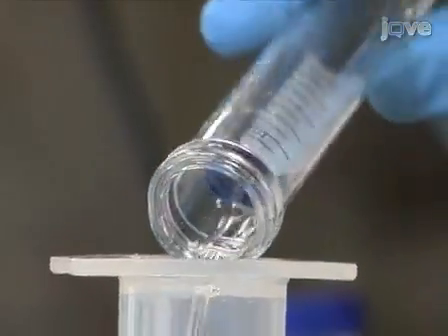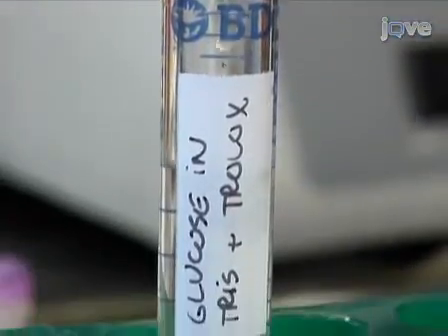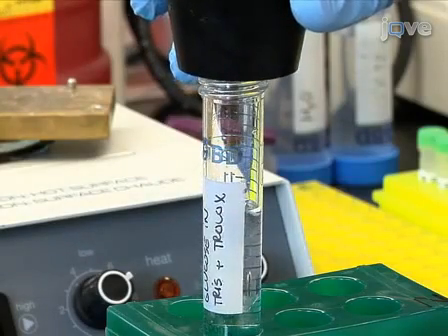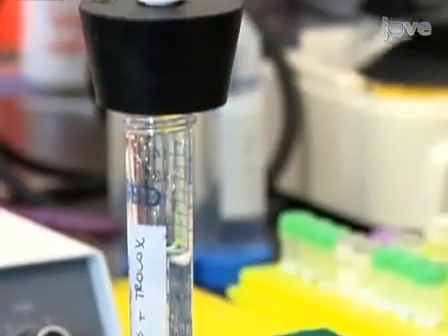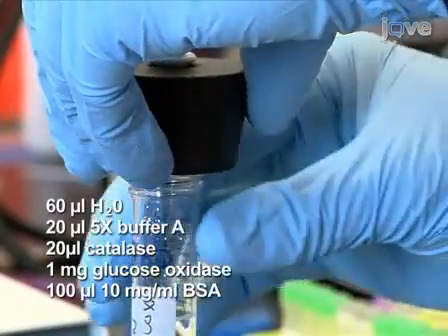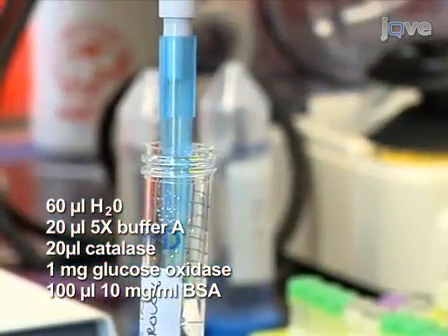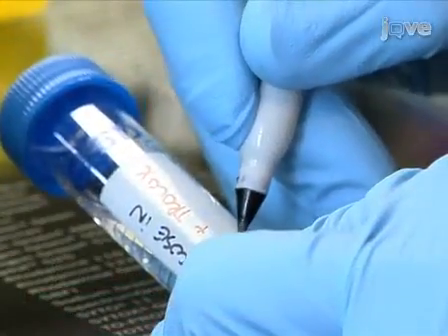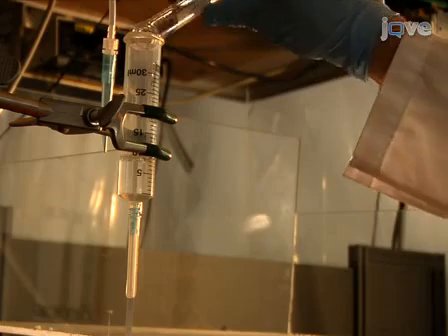Filter the solution and leave it degassing in a vacuum for 10 minutes. Gently mix the Trolox solution with the Gloxy enzymatic solution while avoiding the formation of air bubbles. Fill the reservoir with the IB solution.